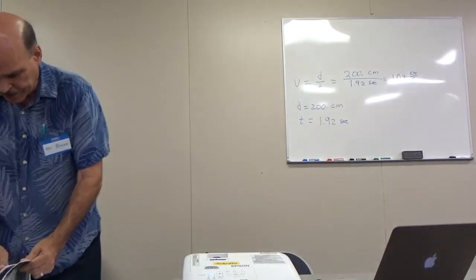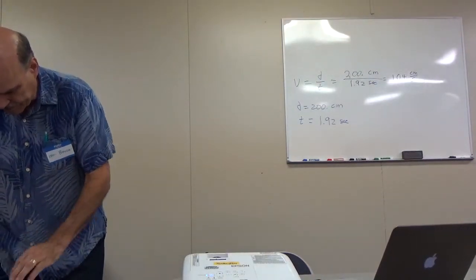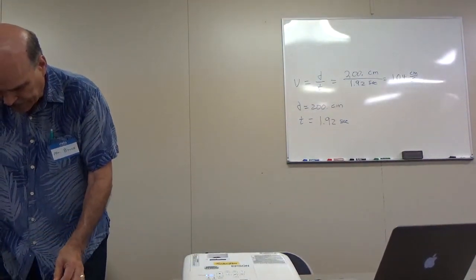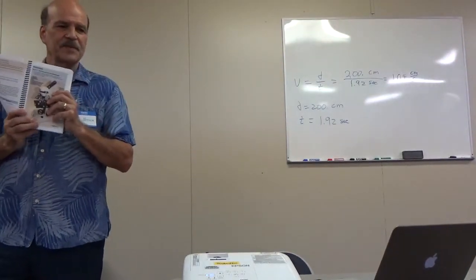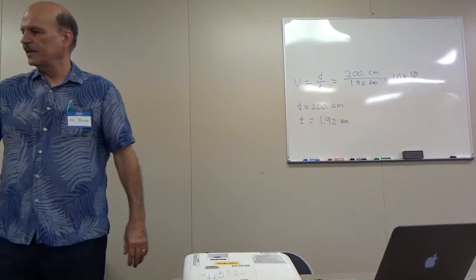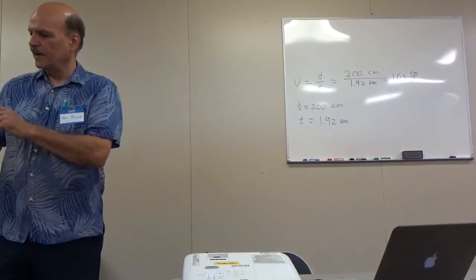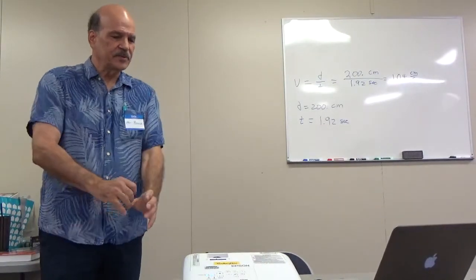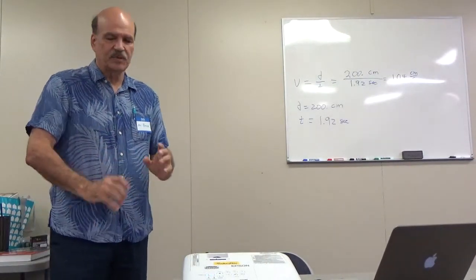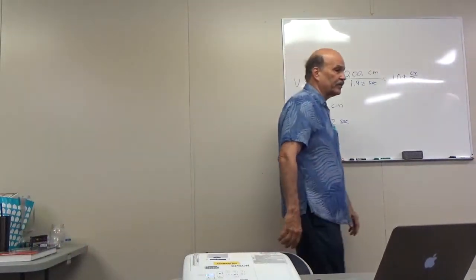If you get your lab manual out, I suggest on page 3, now it has a lot of A, B, C, D, etc. You see a diagram with it, just with the eyepiece. There's what's called the body tube. Now the thing that you look through is called the eyepiece. The objective lenses are the lenses that you use to magnify. It's the same thing for a telescope as with a microscope.